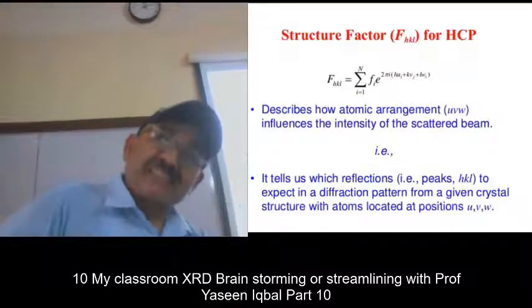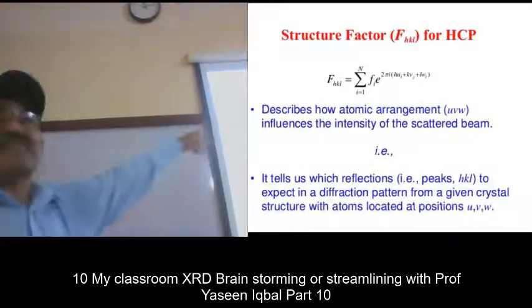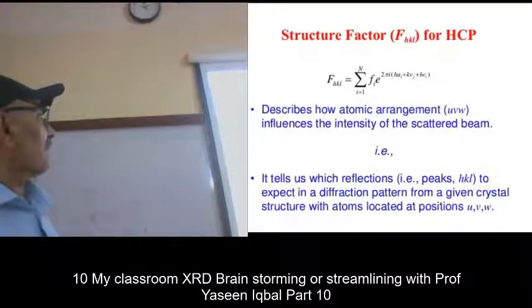If you have less intensity or more intensity, it again depends upon this structure factor.